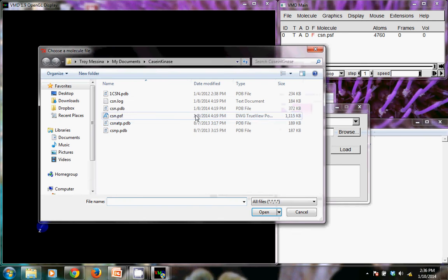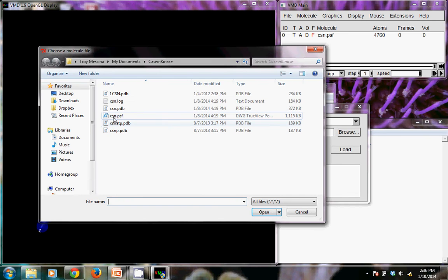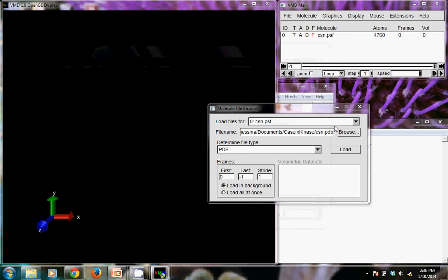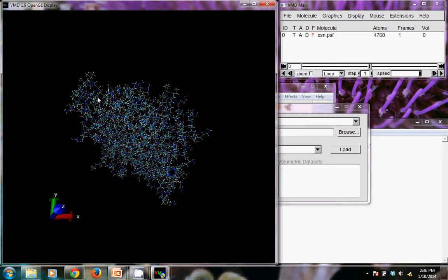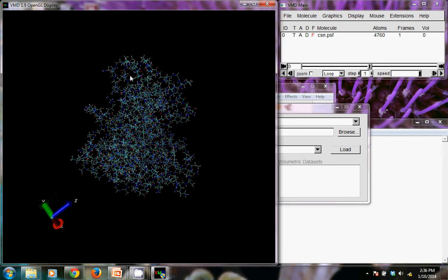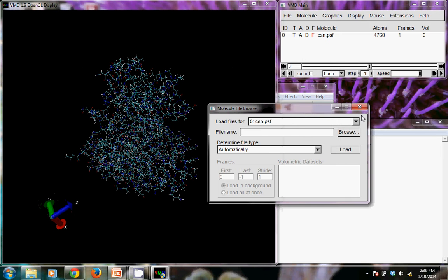You then want to load the PDB file and you'll see it shows up and it has the white hydrogen atoms that were added in the last step. You want to make sure that that is the structure that you loaded.